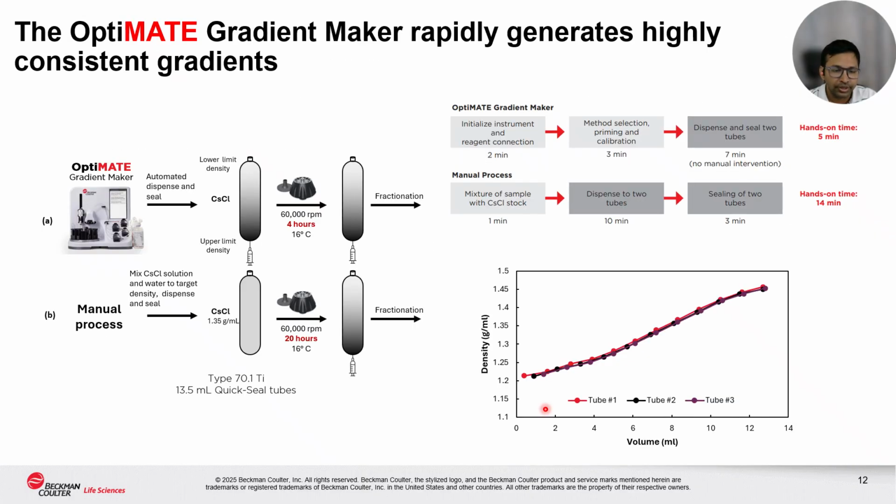So with that, from this slide onwards, we will delve into the details of how we actually are able to test this hypothesis for cesium chloride. Before we get into the purification of AAV, though, we will first delve into the details of the tube setup.